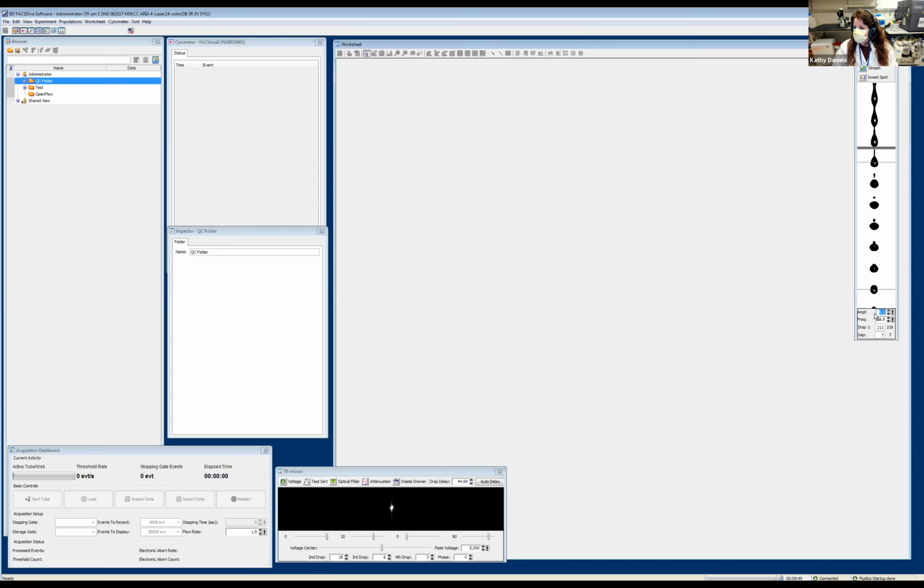So when I first come in, what I'm looking to check at the instrument itself is to make sure that this droplet formation looks as expected. I want to see this nice last attached drop with a gap that's within the normal range for the nozzle that we're working with. I also want to make sure that these satellite drops, which you're seeing right here, I'm clicking, which is why those options are popping up, are reattaching to the main drops.